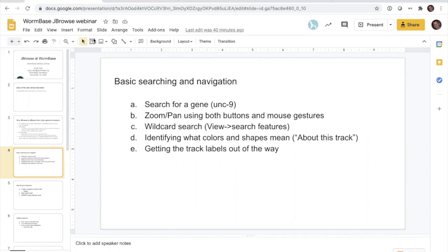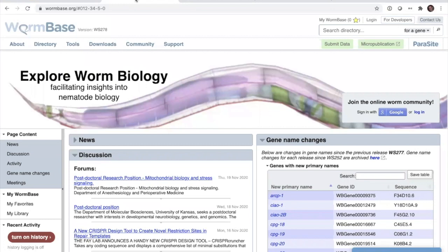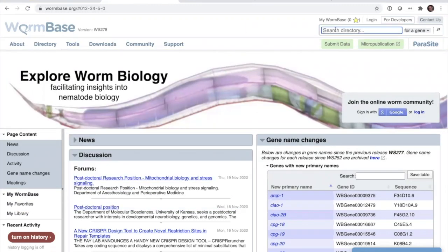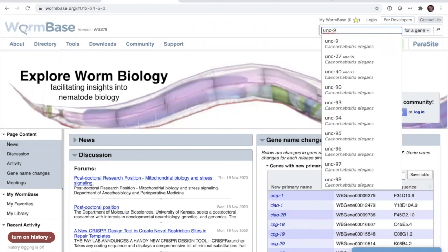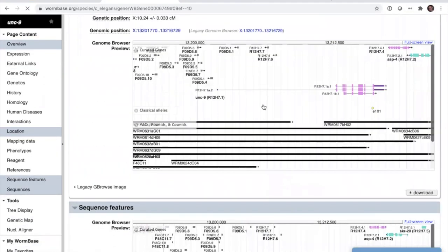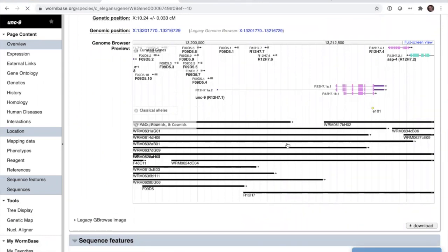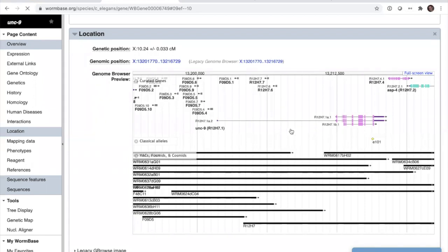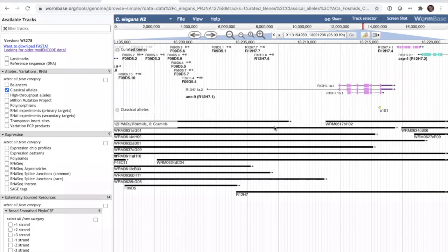Switching over to the WormBase webpage — how do you get to JBrowse? There's a dropdown menu under Tools where you can click on JBrowse. A more common way is to search for a gene, like Unc9, which loads the gene page. Down here there's a little JBrowse screenshot window, and clicking it opens a new JBrowse window. It downloads that JavaScript and generates a picture really quickly.